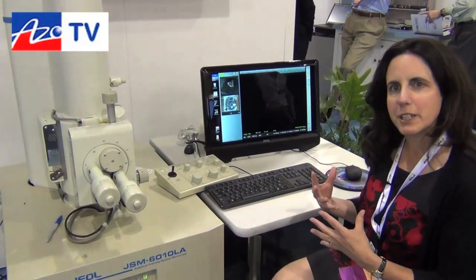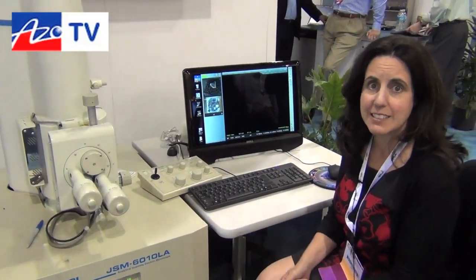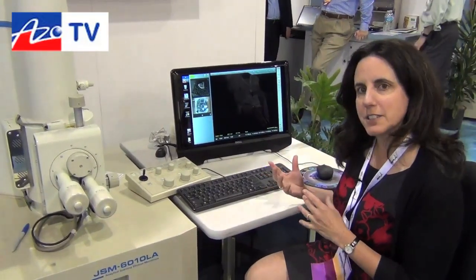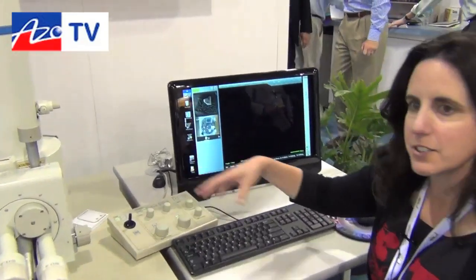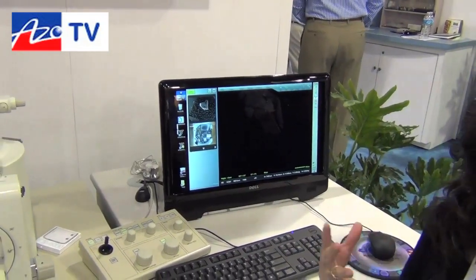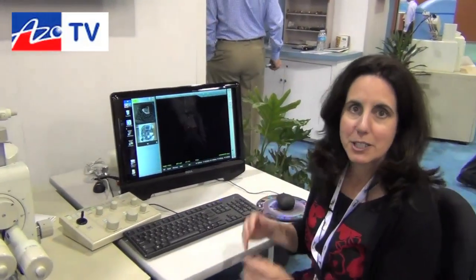It does both variable pressure as well as high vacuum, so you can really accommodate any sample type. It has a very innovative and intuitive interface — it actually has multi-touch gestures so that you operate it much like the smart pads and smartphones that are out in the market today.